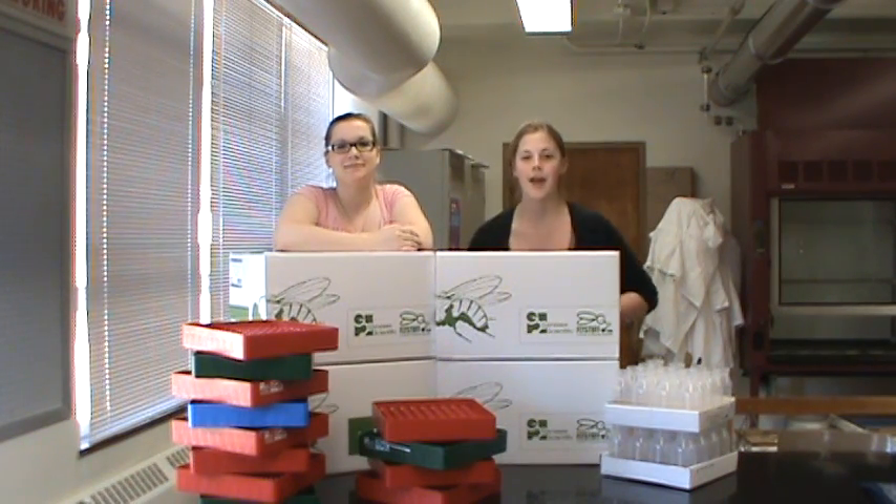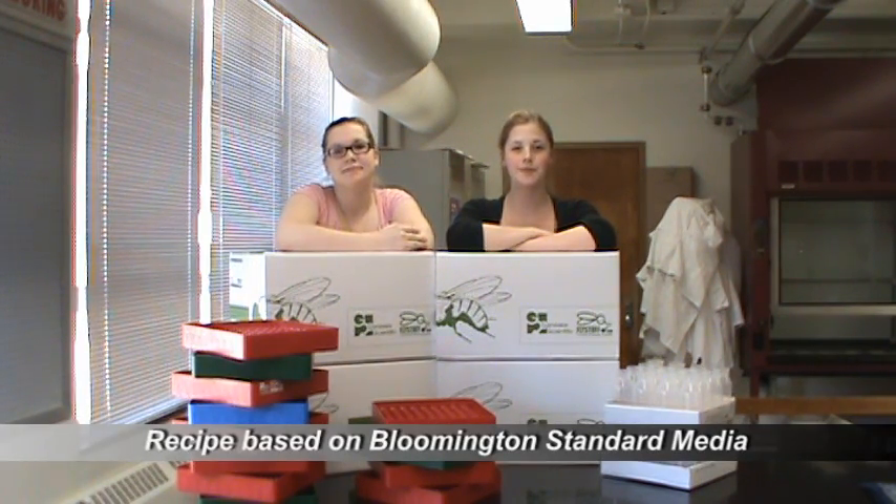Hi, I'm Nancy Levitt-Sailor. And I'm Danielle Hines. We're from Dr. Scott Ferguson's research lab at SUNY Fredonia. And today we're making food for the model organism Drosophila melanogaster.